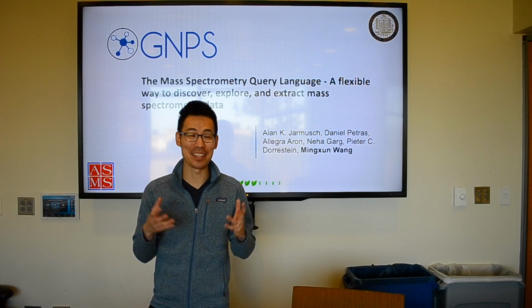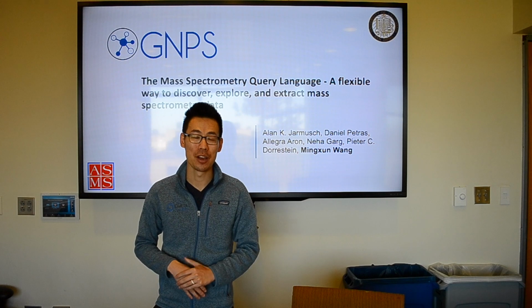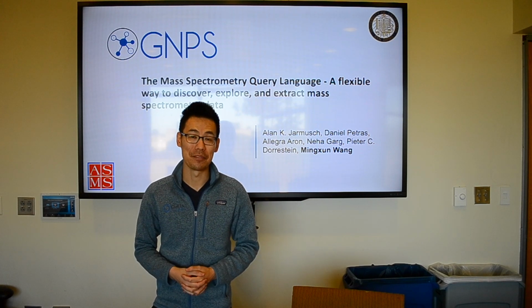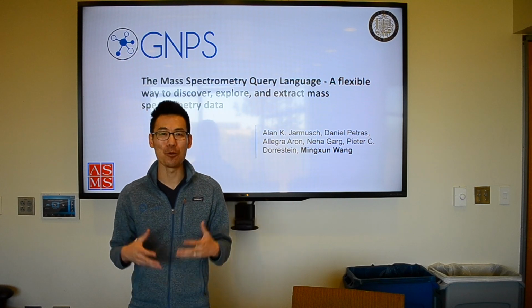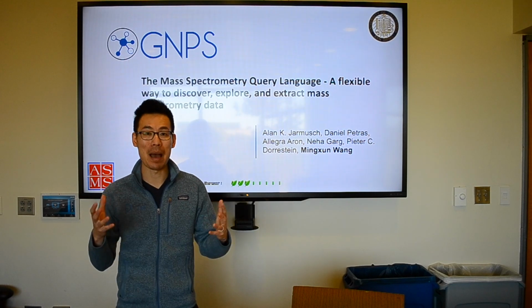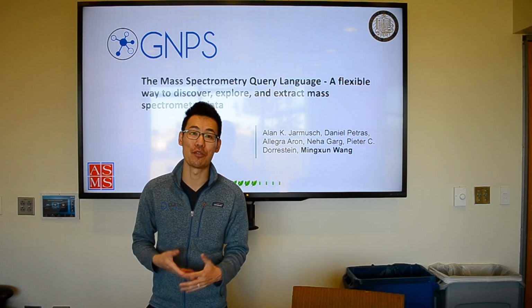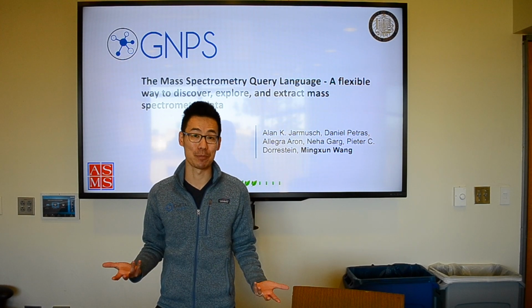My name is Ming, and this is a special Encore presentation for a talk that I gave at ASMS just a few weeks ago in Philadelphia. And so what I want to talk to you today about is the mass spectrometry query language. And we hope that it's a flexible way to discover, explore, and extract mass spectrometry data.